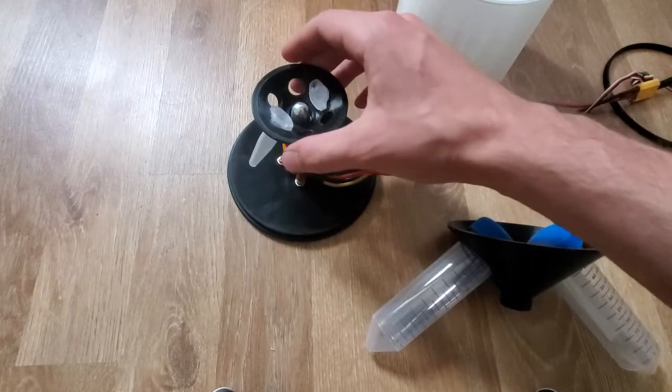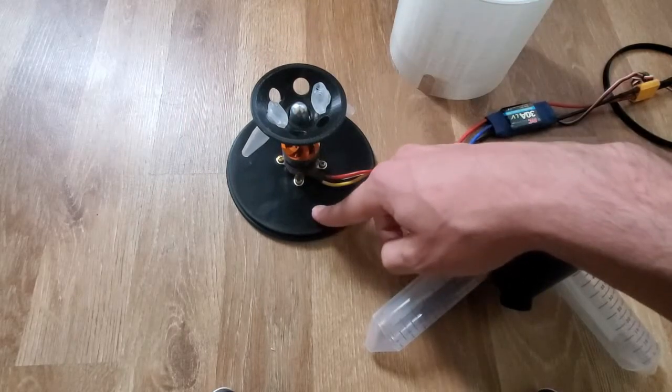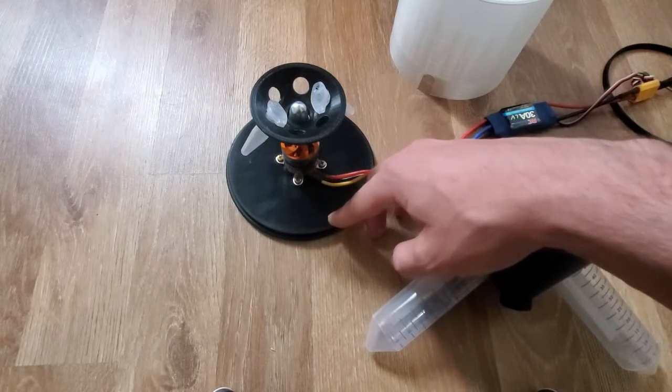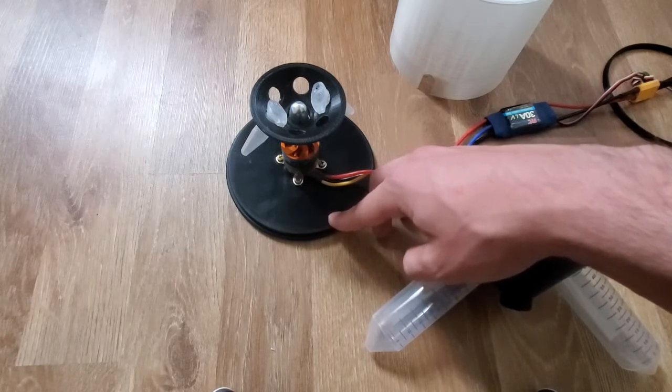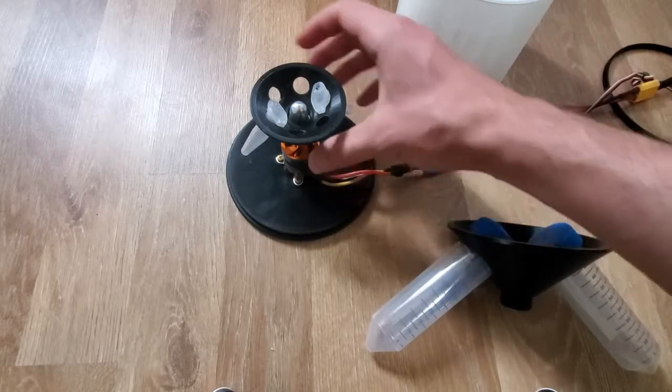Then you've got two more 3D printed parts: the rotor and a base. There are some minor tweaks you could do with the base to get it to stay on the ground better when spinning, maybe adding sticky feet or something, but it does the job of holding the motor in with some screws.